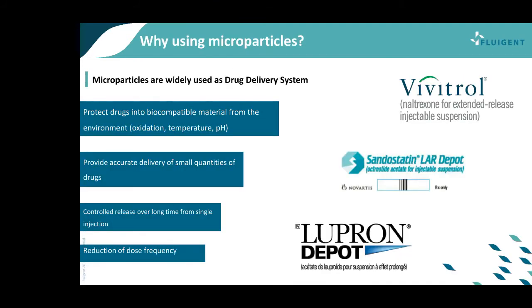So why are we using these microparticles? Microparticles are widely used as drug delivery systems. Why? To protect the drug in a biocompatible material from the environment: oxidation, temperature, difference of pH. This allows us to target specific sites and avoid degradation during the physiological transport.